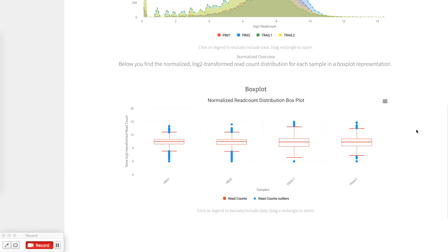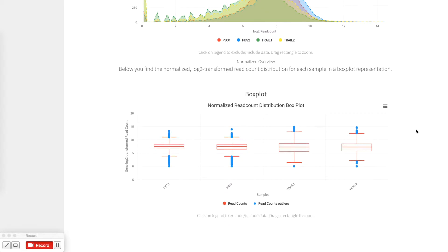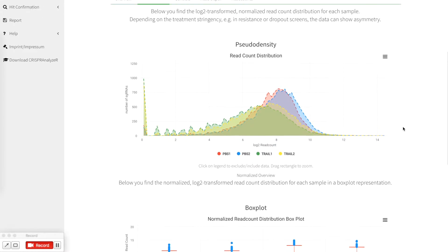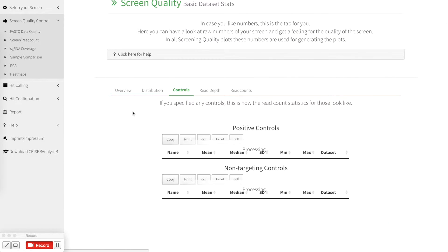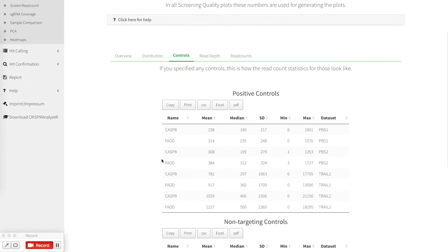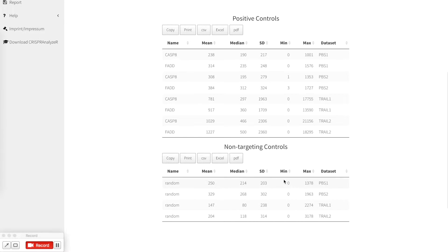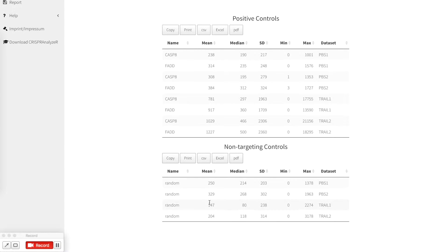The box plot distribution is in principle the same. Then you can go on. If you have set controls, those controls will be highlighted here in a similar way, giving you a brief overview showing the median and the mean for each of the controls in each of the data set.